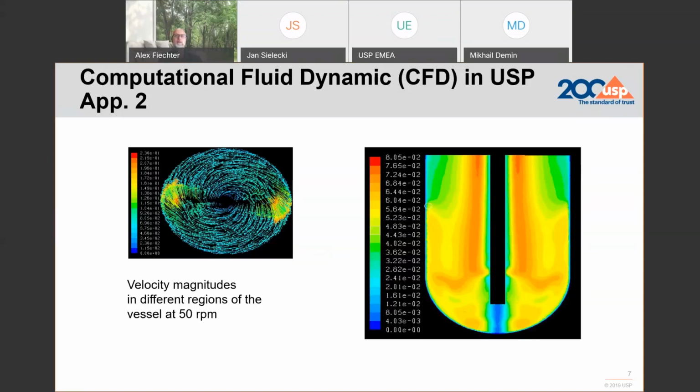Some of them are even using peak vessels, which means that in development it is still possible to use vessels that have a kind of glass peak or a glass bowl or whatever, just to prevent the specimen from sitting underneath the shaft and to expose it more to energies and fluid dynamics around that. Again, as I said, for development purposes, that is a great thing.